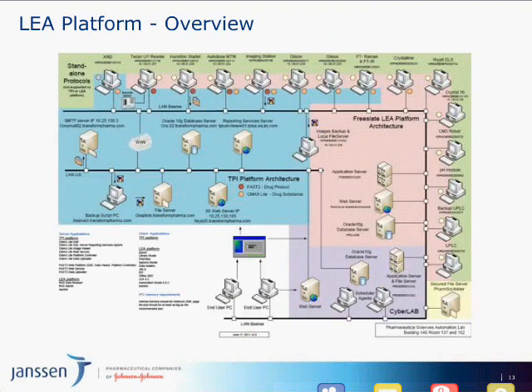This is an overview of the LEA platform in our site. We have 15 instrument pieces integrated into the Freeslate LEA platform, and some are direct integrations, like UPLC, and some are integrated by way of the LEA data uploader, like XRD.